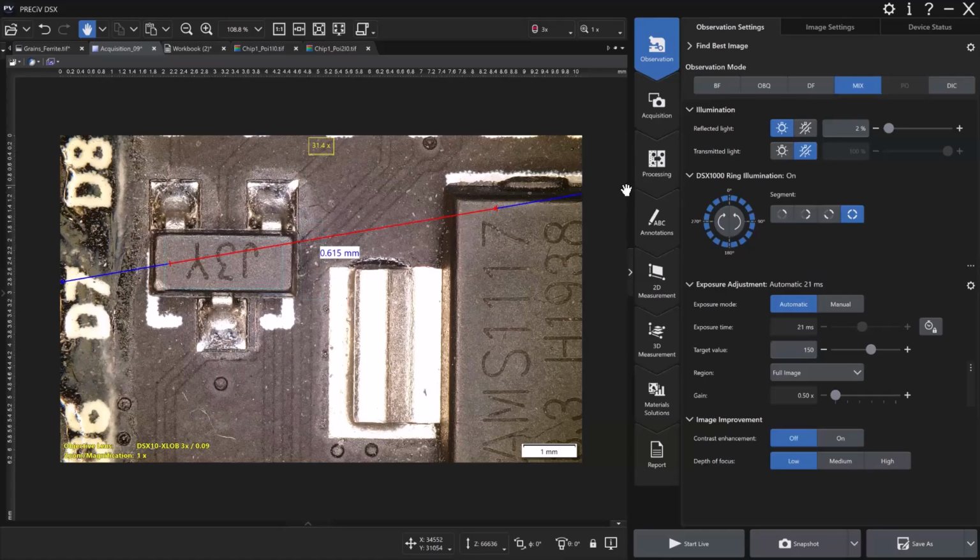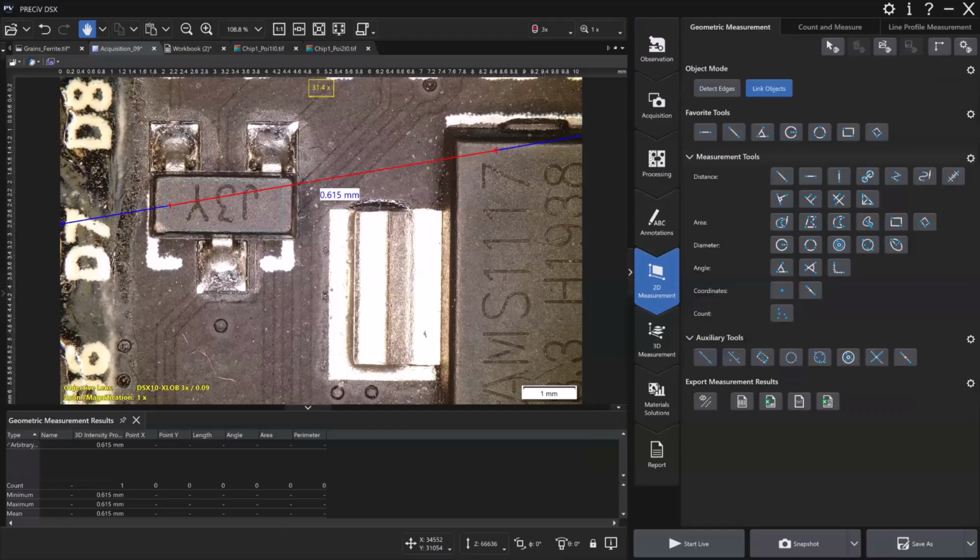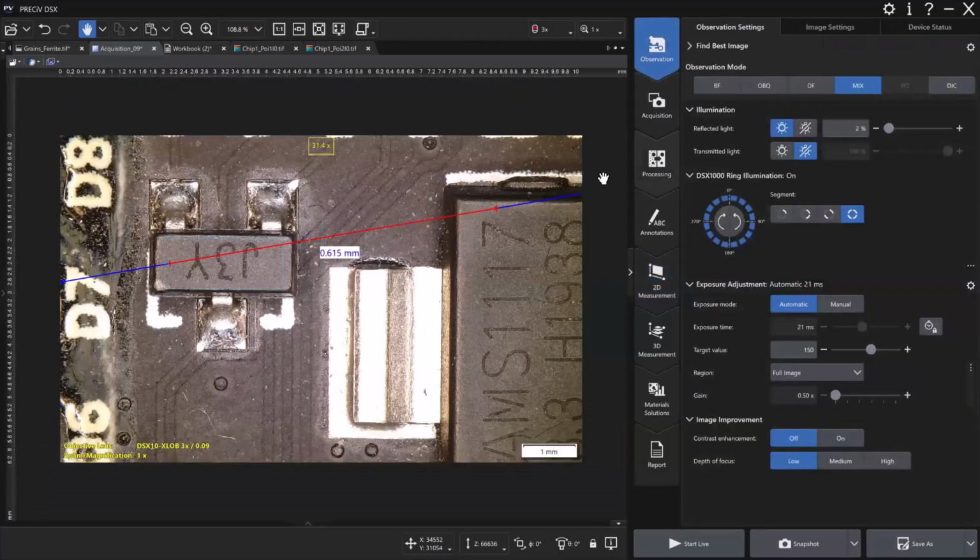But again, verification of the calibration, a check, that might be done weekly. I have some customers that do it daily. They put on a known standard and they're trained to do certain points of measurements on that standard using the software. It's great using the detect edges because it improves the accuracy, and they verify their calibration as often as needed. Some customers require it yearly. So it's an internal requirement in most cases.